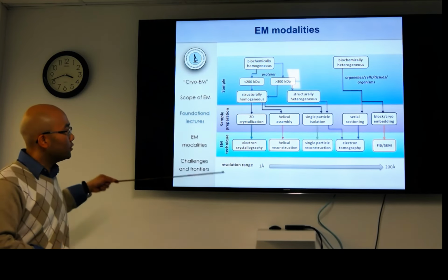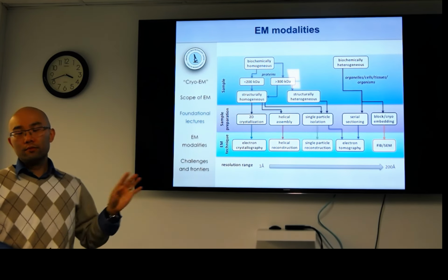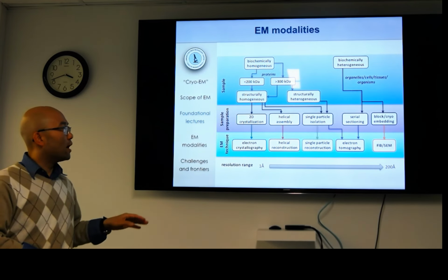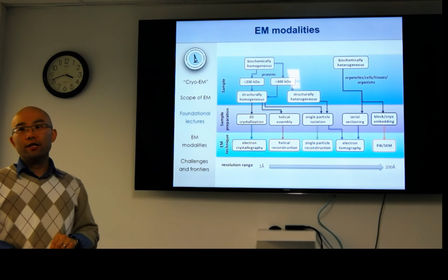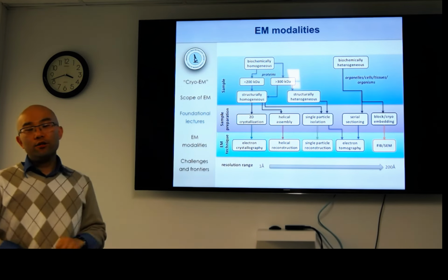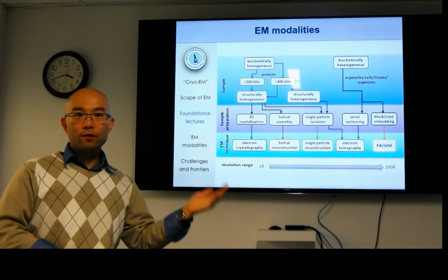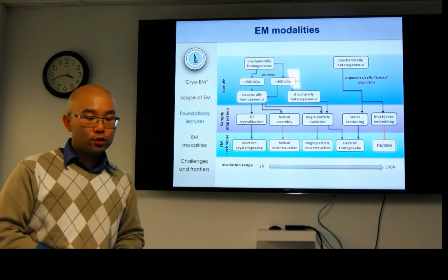And so there's a balance between how you prepare your sample and what range you look at. And then that brings in the question of which modality you are interested in. Just like there are different structural biology techniques, within EM there's different flavors of how you use an EM. From all these particular techniques, you can use the same microscope and you get a similar result in raw image, but how you process it and how you treat your sample is quite different.